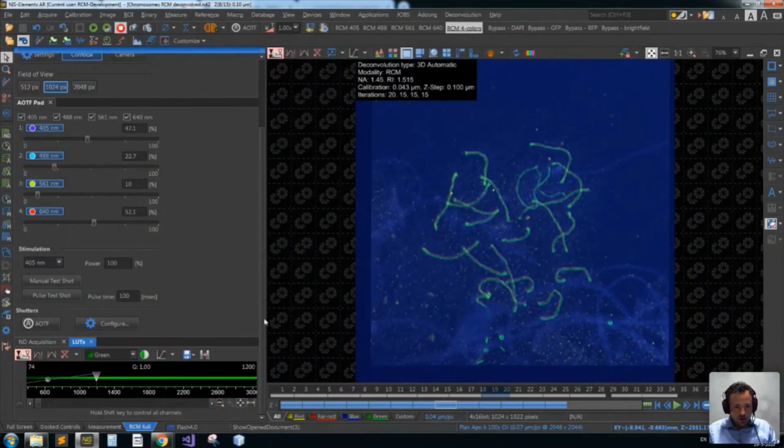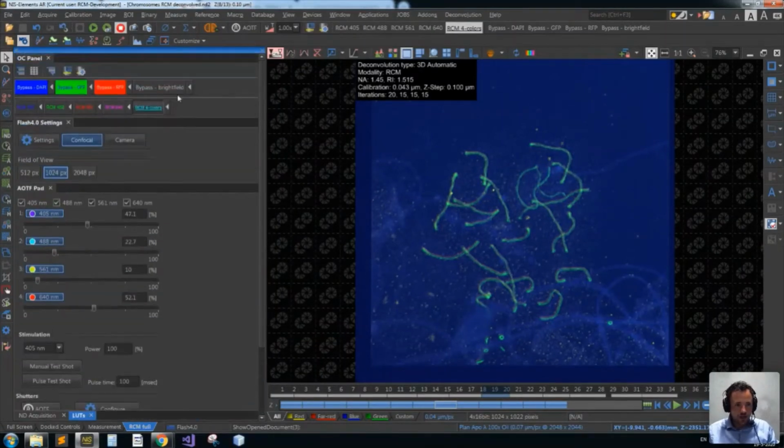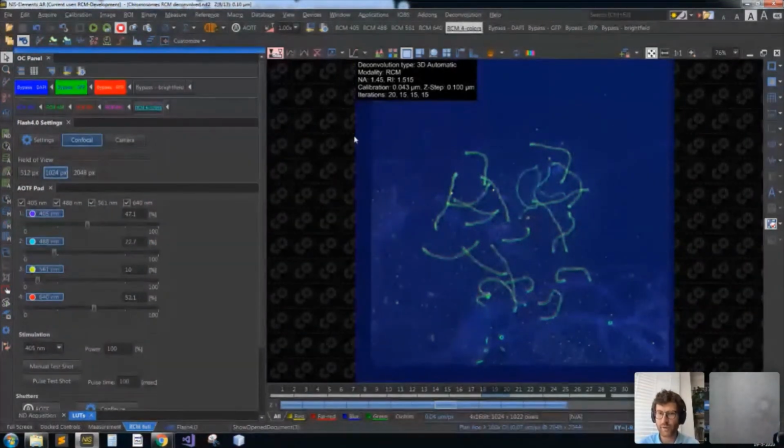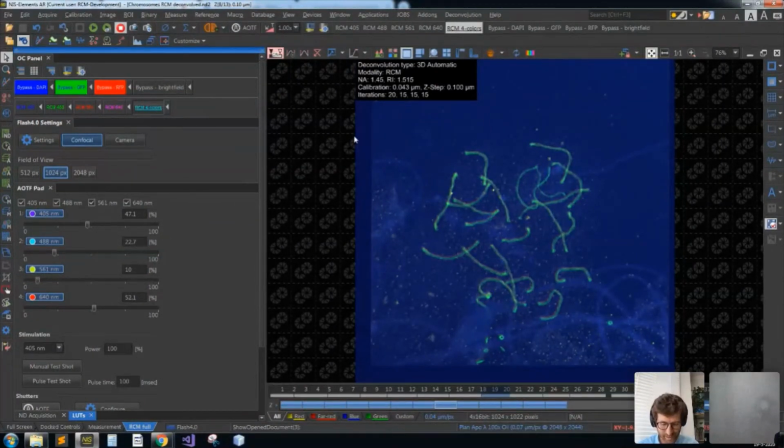So what I can do next is put the next sample. Perhaps Vincent, do you have some questions to answer in the meantime, while I put the sample? Yes, we had a few questions. So again, if you have more, feel free to write them down, and we will answer when we can. But we already have a few here.